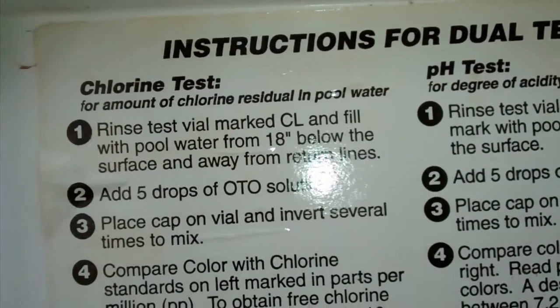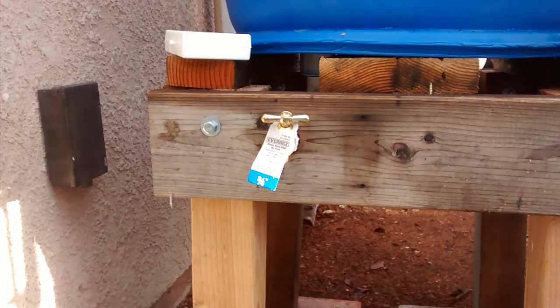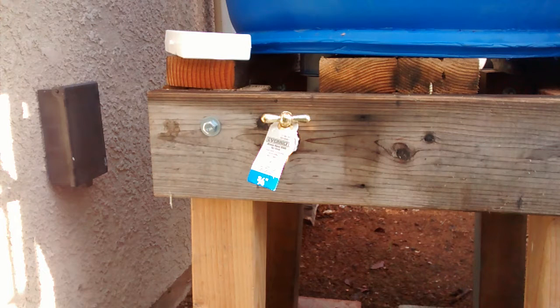So anyway, here you go. So let's do the chlorine test. Again, I apologize — I do have a bit of a cold.